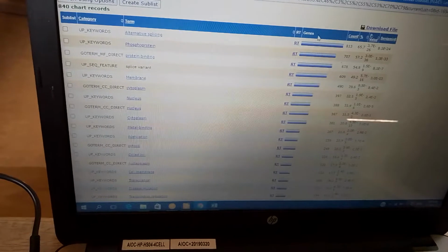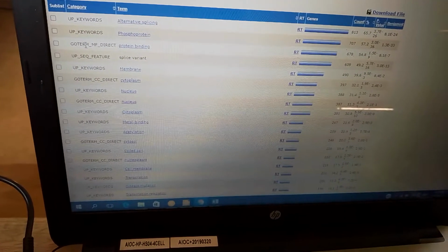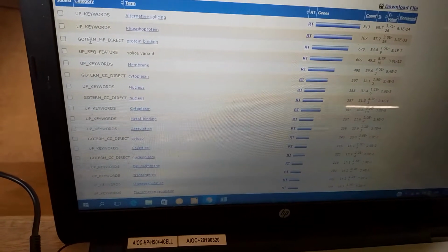So we'll go, the first biological process that we identify, that is enriched, since we have categorized our genes into the most enriched. Okay, so we'll have to come here and look. So when you see this GO term, it means the gene ontology term.